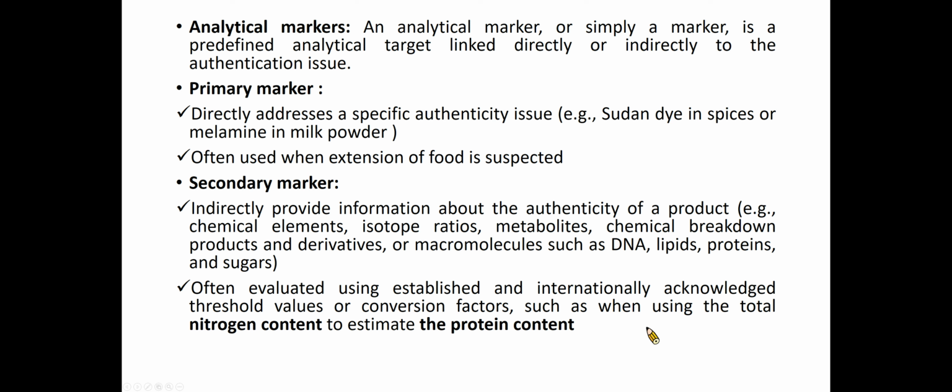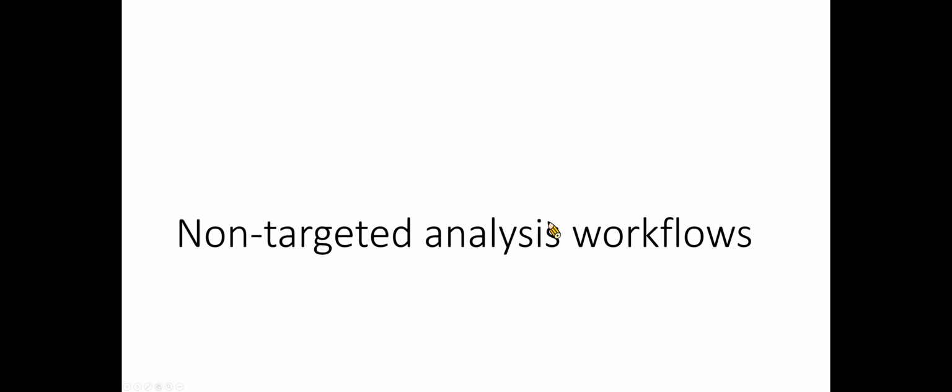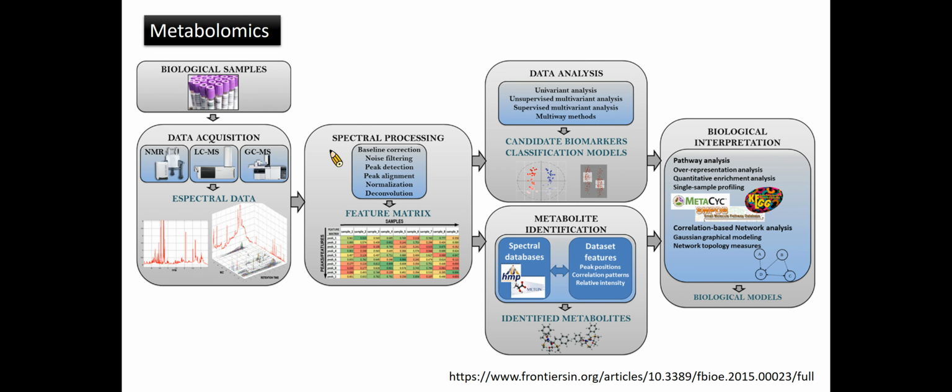Here are some basic definitions for the terms used in the previous slide, just for your reference. In the following slides, we will go through the typical workflows for non-targeted analysis. These slides illustrate the typical methodological pipeline of an untargeted metabolomic study.